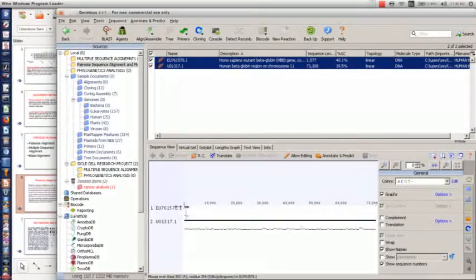So as you can see, it's way smaller in number than the normal gene. Are you getting it now? The normal gene now. So this is telling you that this mutant gene was extracted only at the region of mutation, where mutation takes place in the hemoglobin beta gene, yielding sickle cell. So the regions that were extracted for the mutant gene were the regions where mutation took place.